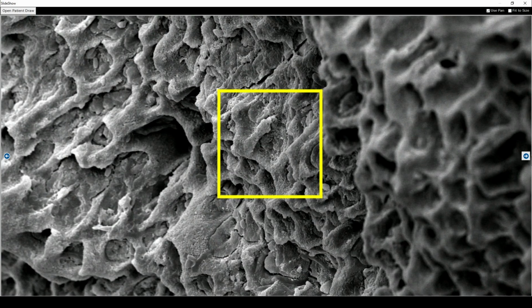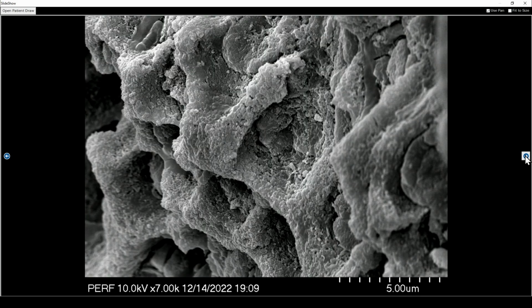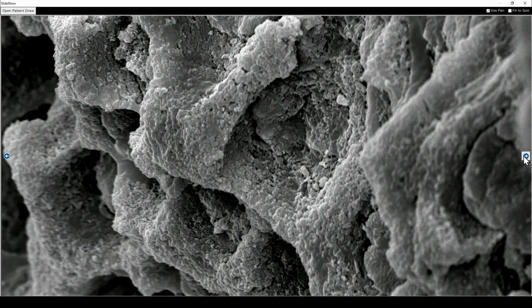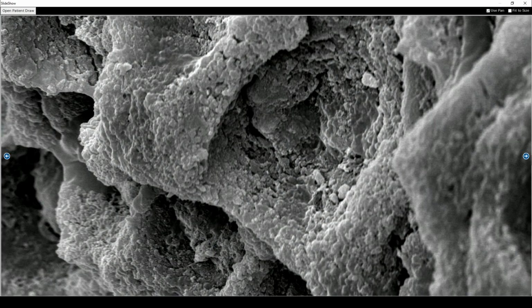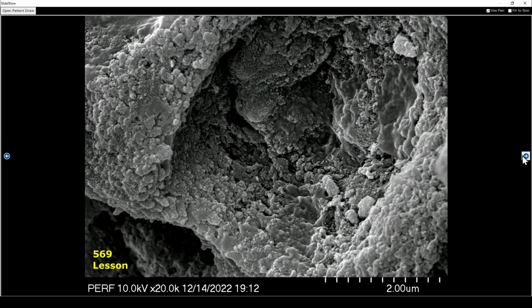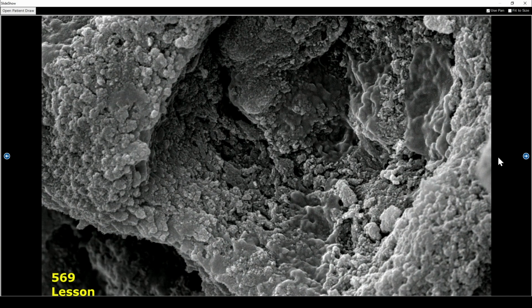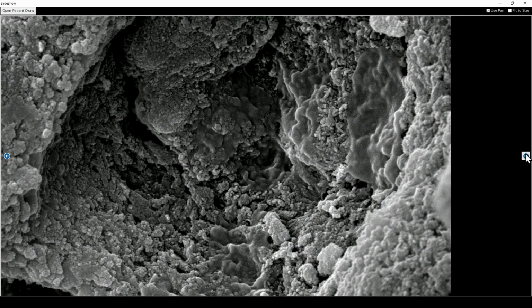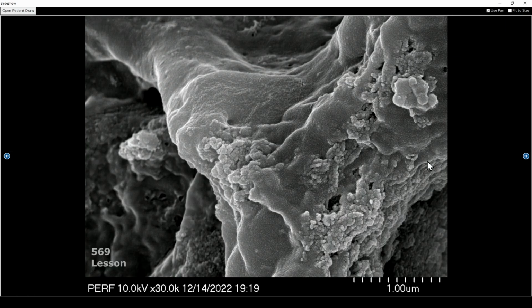I've tried to make some examples where maybe it's a little more difficult to look at this. When you look at this, you're looking in a dentinal tubule. It's not immediately obvious that there's biofilm there. You see the calcospheroids from the decalcified human dentin. But if you look carefully, you can see that melted molasses look to it with bacterial morphotypes embedded within that matrix. And now your level of suspicion is really raised when you see that.